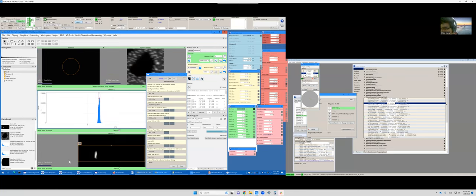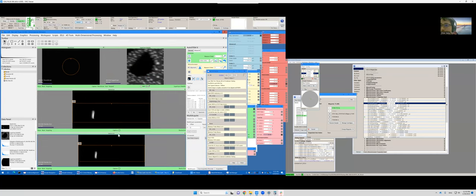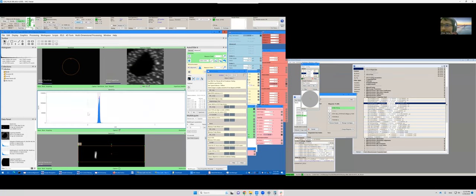We are showing in two panels vertically. So if unclicked, they are the same. Actually, both these regions are showing the image on the EELS detector, but we can choose capture. It will send the data vertically, so you can see an EELS spectrum. And you can see right now the peak width is 25 millielectron volts. And if you look at the image on the detector's camera, you will see it is blurring. That is because the monochromator slit is charging.